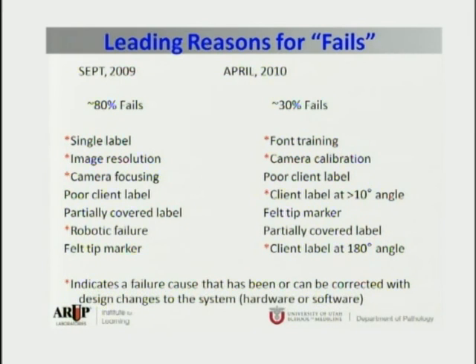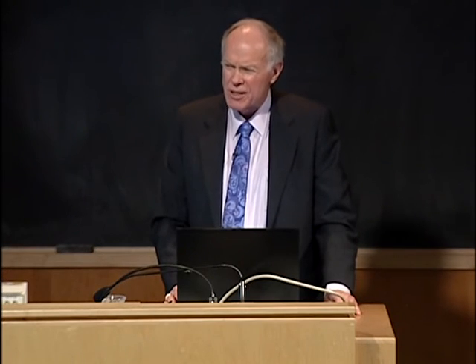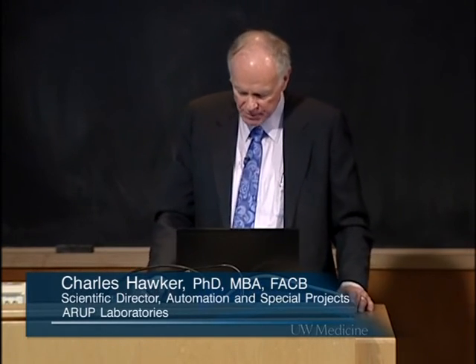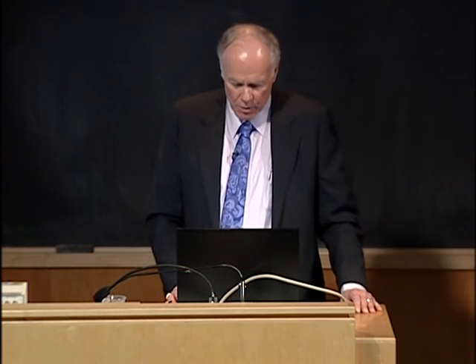With the work we've done up to this point in time, we started out at about an 80% failure rate, we got that down to only a 30% fail rate, and then the most recent work that we've done is at about a 20% failure rate, and there are still some things that we can work on to improve and get that even better. Our objective is to get it down to about a 10% fail rate, or a 90% pass rate, so that only 10% of our daily workload of say 50,000 specimens a day requires human inspection.